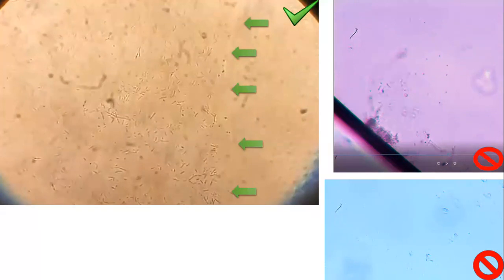Those that are anaerobic, or obligate or facultative anaerobes, will settle at the bottom. More biomass will be sedimented.